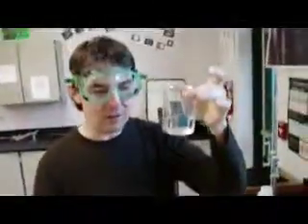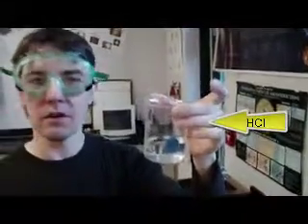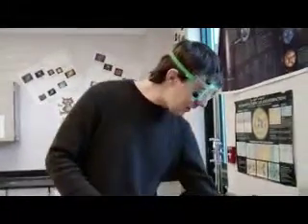Very good. All right, now, other times you may be dispensing a liquid acid. So today we're going to be using an aqueous acid. This is hydrochloric acid that's dissolved in water. I don't know the concentration of this. This is what we're going to determine the concentration of in our demonstration here. Now there's a few ways that you can get the acid, a very accurately measured quantity, into the flask. So the first and probably the best way is to use a volumetric pipette. Okay? So on a volumetric pipette, you'll suck it up in here to right on the line here.